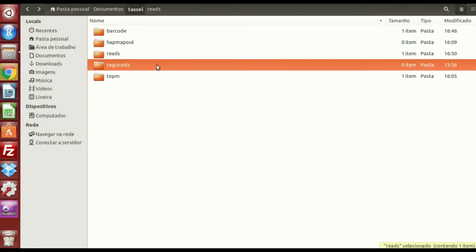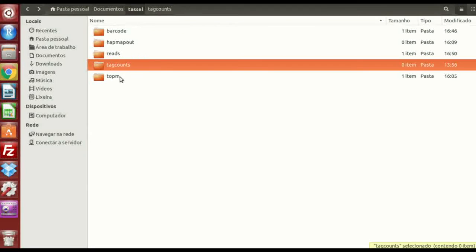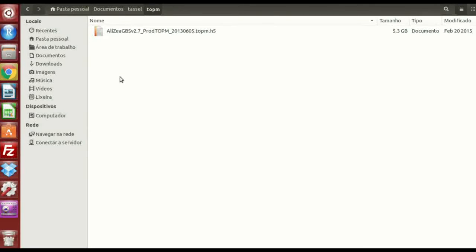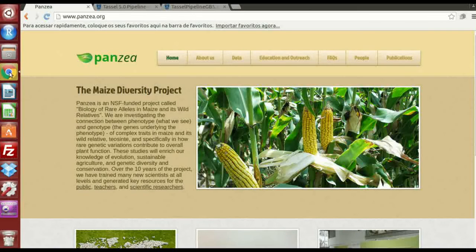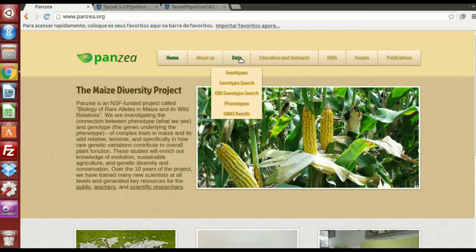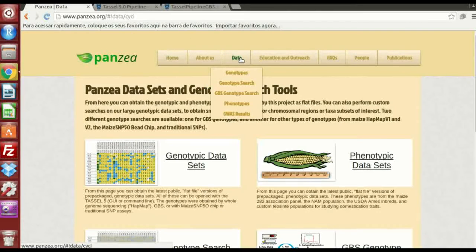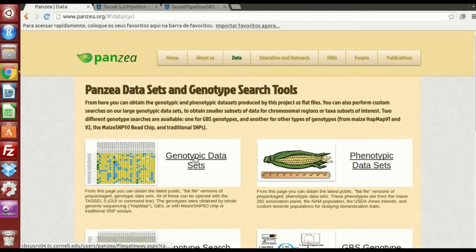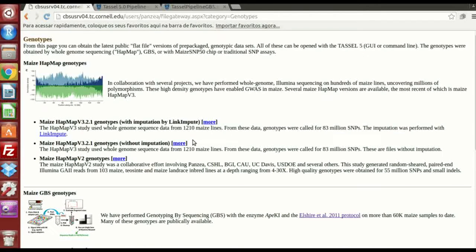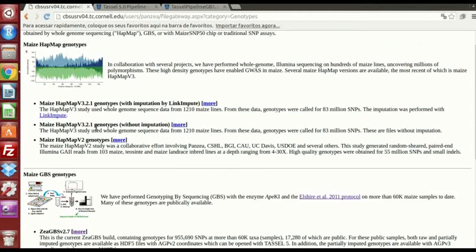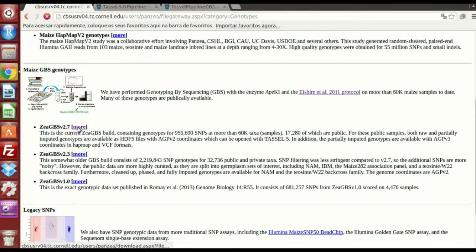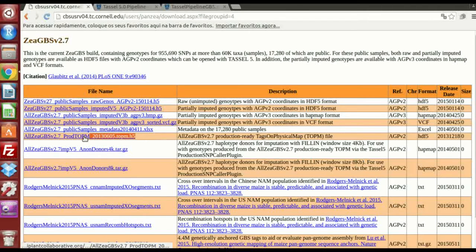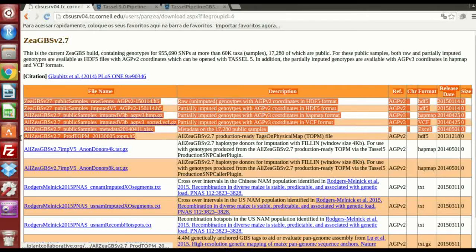Tags counts is empty too, and topm. This is the tags on physical map, for each crop or each species you are working on, they have already done this, for Maize it's easy. And how to download this file, this 5.3 gigabyte file. You should go to the panzea dot org, you go to data, genotypic data sets, and you go here. Maize GBS genotypes, and click here in more.